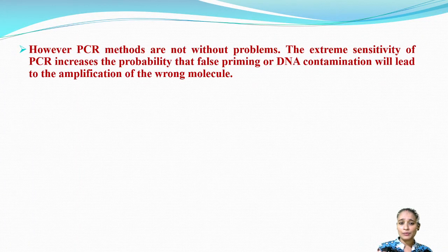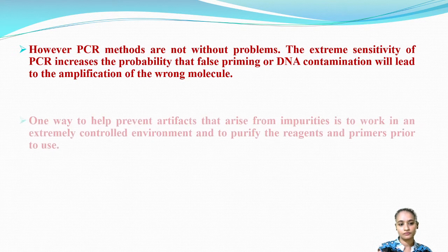However, PCR is not without problems. As all technologies come with some pros and cons, PCR also comes with certain pros and cons. The extreme sensitivity of PCR increases the probability that false priming or DNA contamination will lead to the amplification of the wrong molecule.